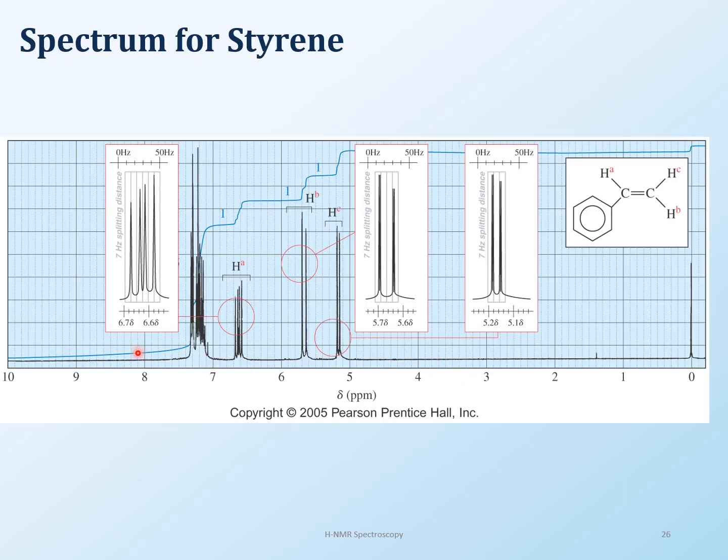And that complex splitting, you can see what it looks like. This is styrene, same molecule, but you get so many doublets because everything is splitting with everything. So it seems like there is too much going on, although it is just a splitting effect. It's just coupling. That's all that's going on in here. But that's what happens when you have double bonds in there. You end up getting a lot of different kinds of splittings, and you have to do a little bit more in-depth kind of a study for that.